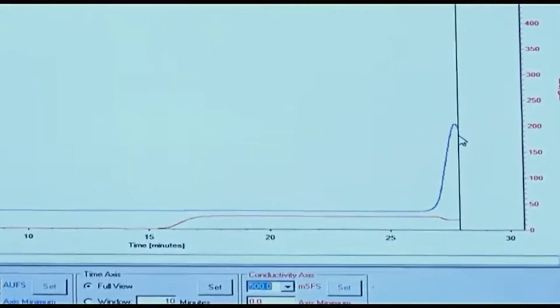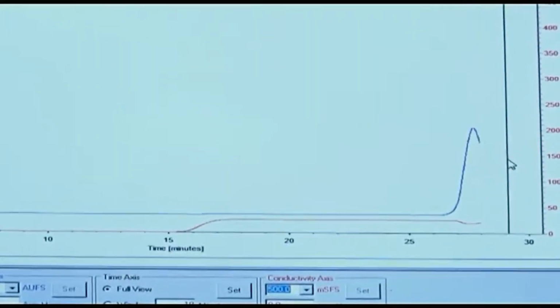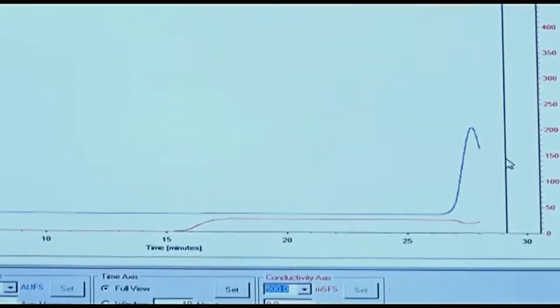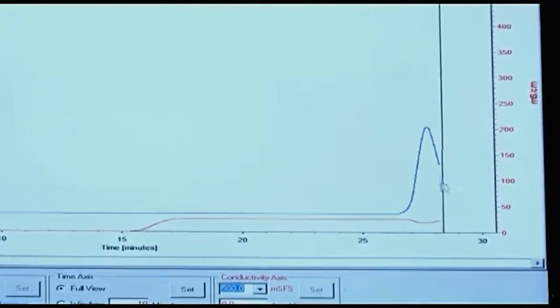Whatever protein does not have these consecutive histidine residues will come out right now, because it will not get stuck to this nickel column, and as we have 10 millimolar imidazole, it will displace any kind of non-specific or weak binding of other proteins. Now it is going down.